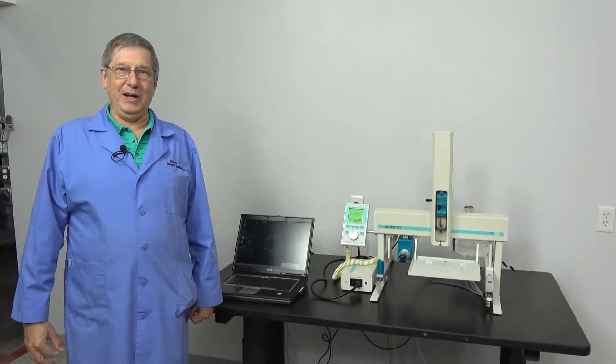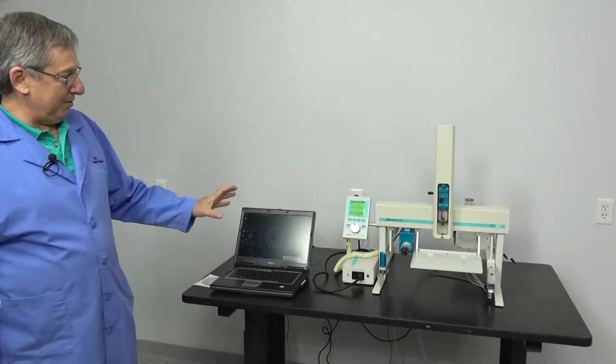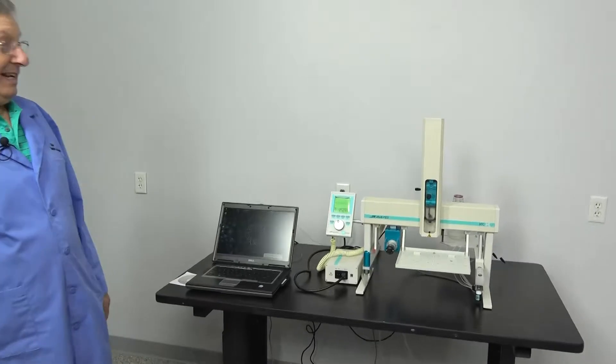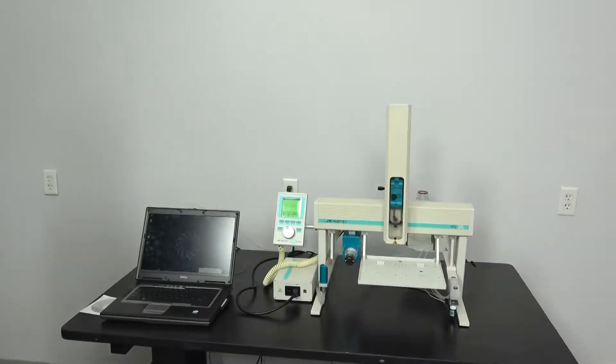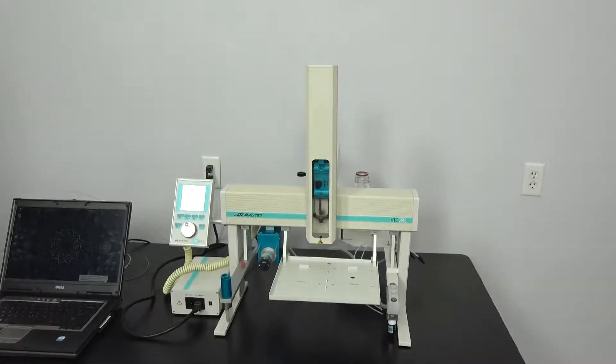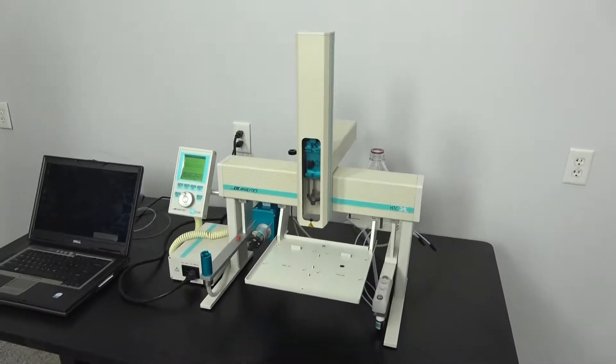Hello, welcome to New Life Scientific. Today we're going to be talking about the PAL systems by CTC Analytics. This particular model is one of their smaller, more diminutive models, the HTC PAL.